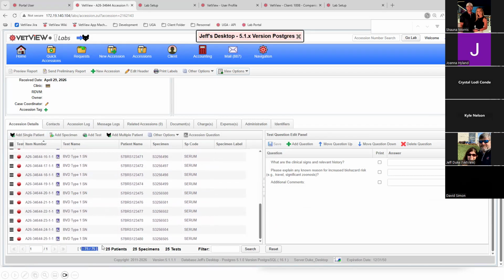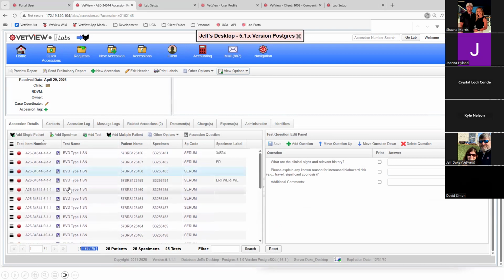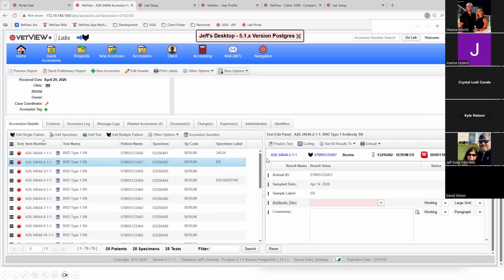Our paging changes. We can actually offer you more per page in this view because it's more of a condensed view on the screen. But again, it doesn't prevent that. You do have what we call a pancake menu that lets you then edit specific things or get to the menu easier as well. Again, you can still do all the things we were doing before. It just is in a different view there.